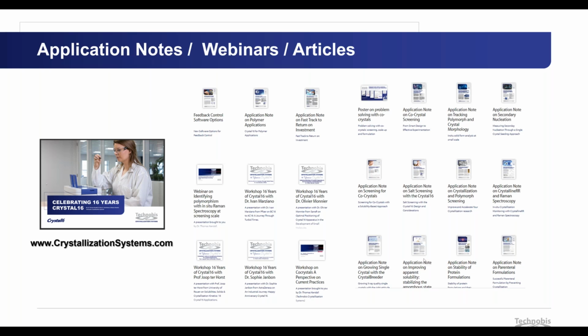A question related to crystallization screening. There are a few methods that I have mentioned that you can do with the Crystal16, quite a lot of versatility, quite a lot of methods that you can easily use, like thermocycling and slurry. You can do a shorter term, a few hours, a few days, even a week or 2 weeks.